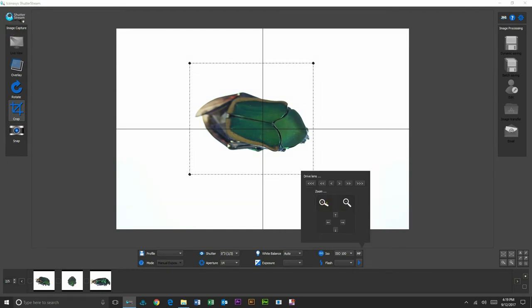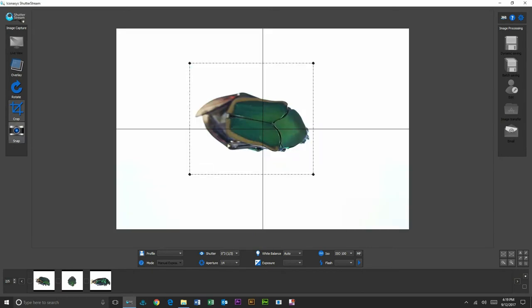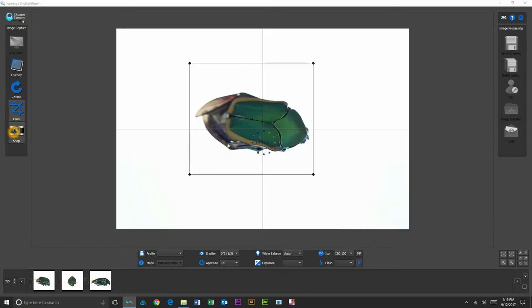Again, we can choose our focal point, should we be required. Looks like we're doing really good there. We'll take our fourth image.